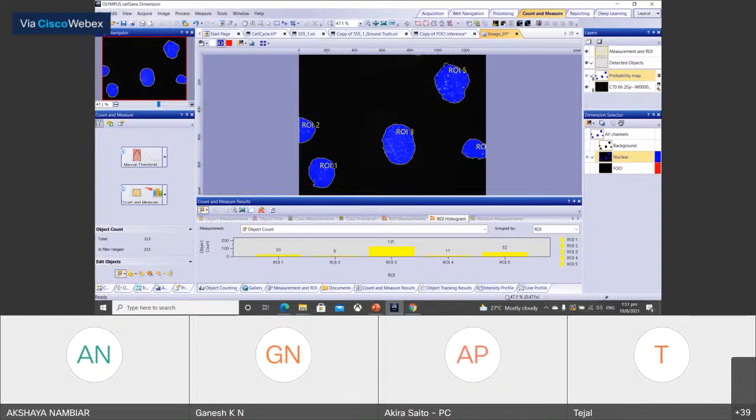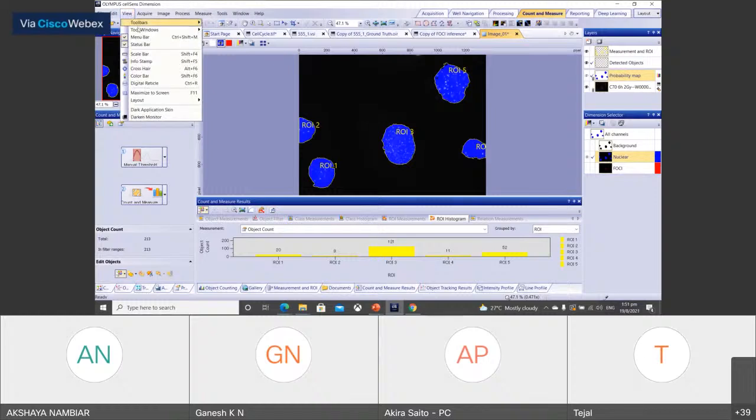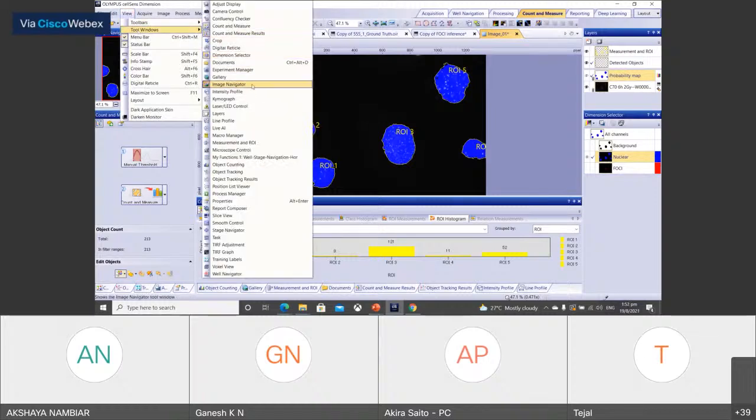But how it works is that first we need to create the objects, and then there is tracking. Tracking is also one of the optional modules. But if you have it, then tracking. Yes, here it is, object tracking.